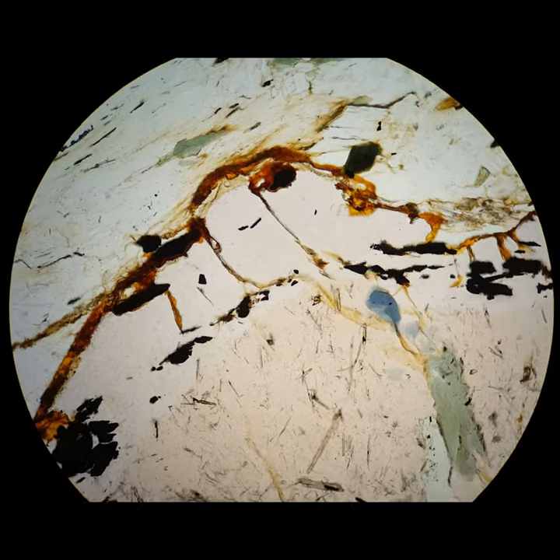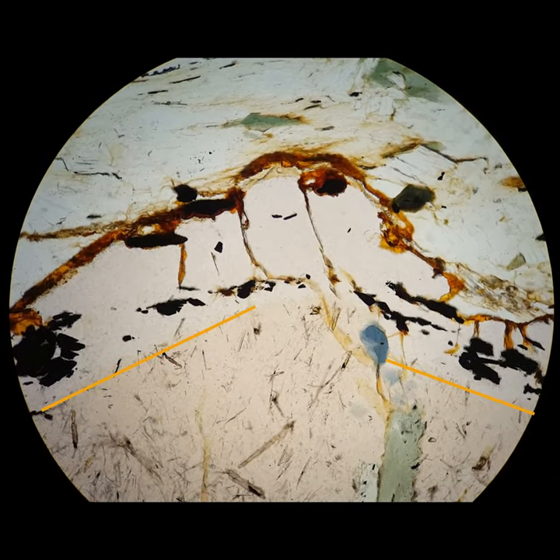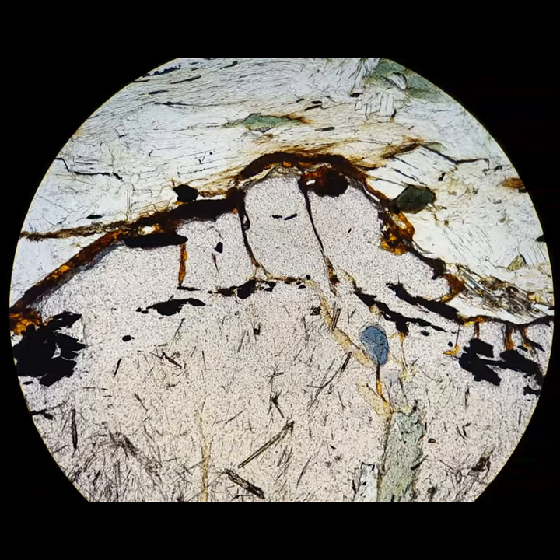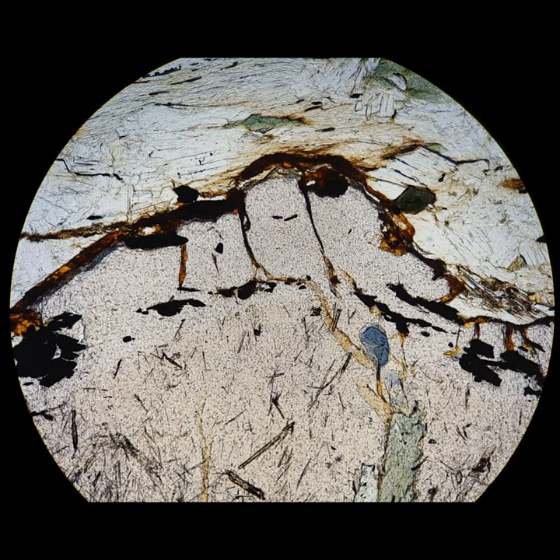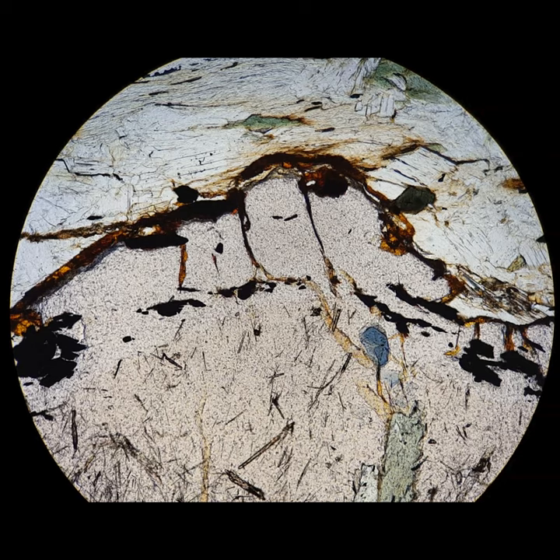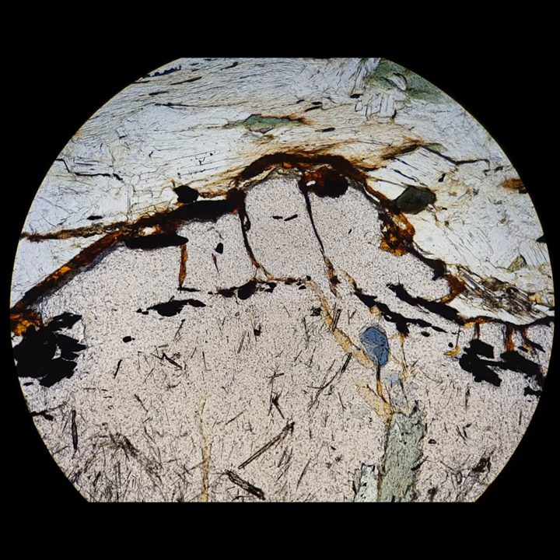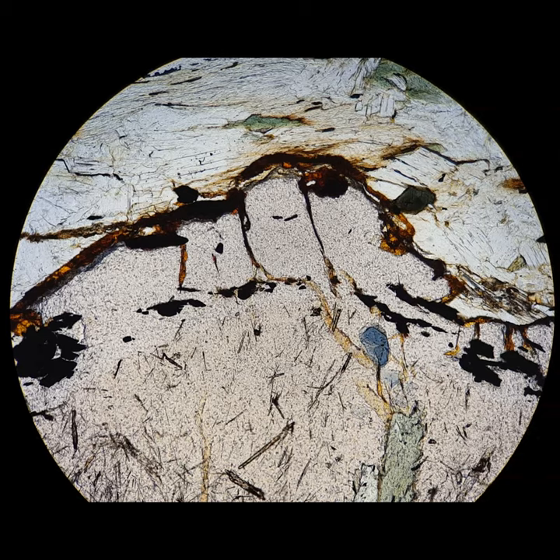I can show you some little boundaries here to make that clearer, but in normal polarized light it's very hard to see this. The sub-stage condenser makes a big difference. This reflects chemical zoning, but in exactly which elements, you would need an electron probe to figure that out.